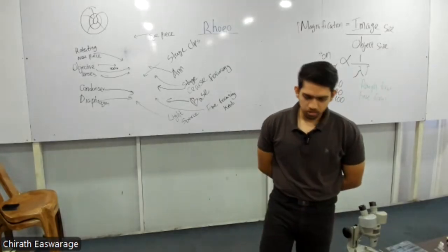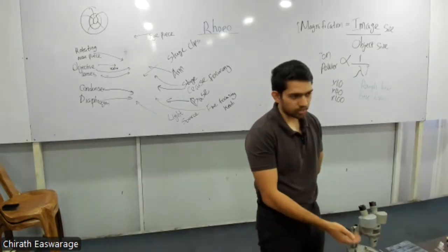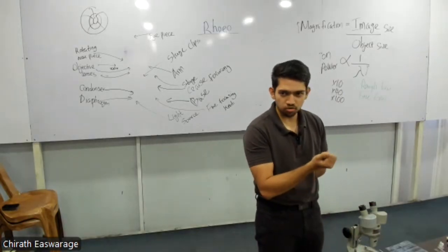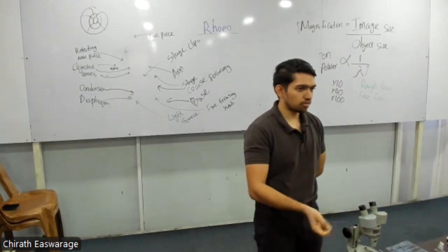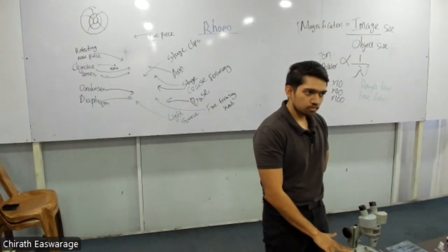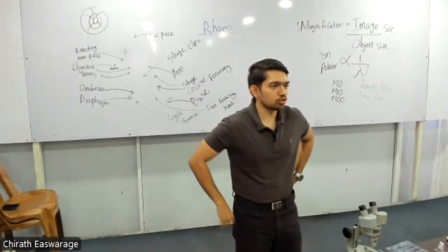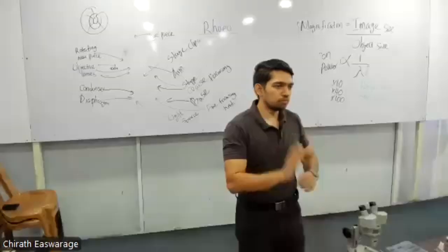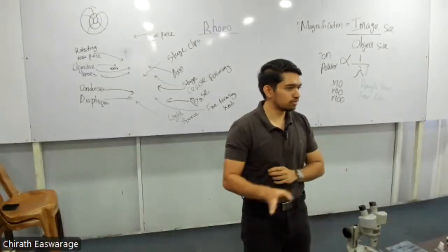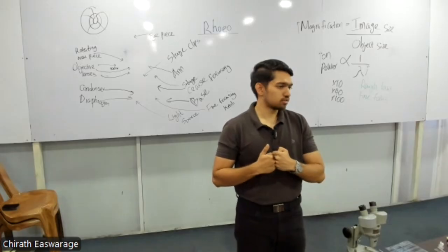Living and non-living objects can be observed by what? Light microscopy. So this onion peel has living cells still because they are still in water. No? So for maybe about a few more hours until they get dehydrated, they are still living. Yes. Okay. But in electron microscopy, because of two things, first they are going to die when they are coated with those heavy metals, right?